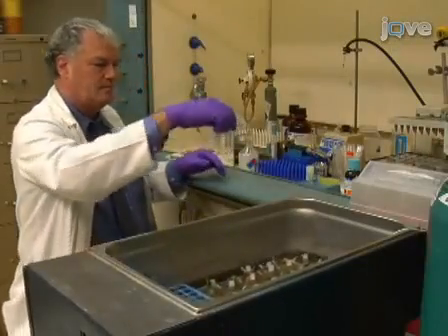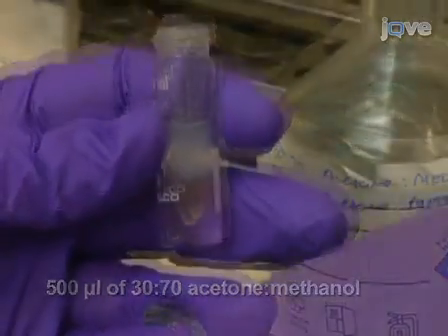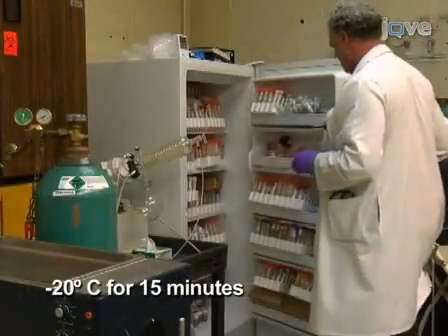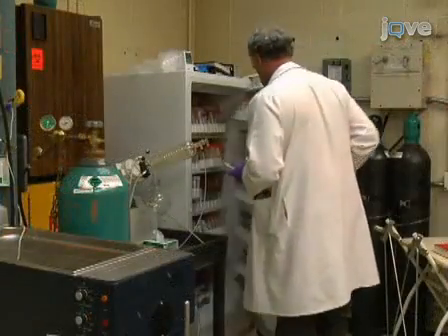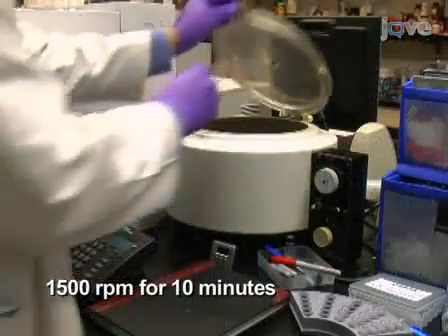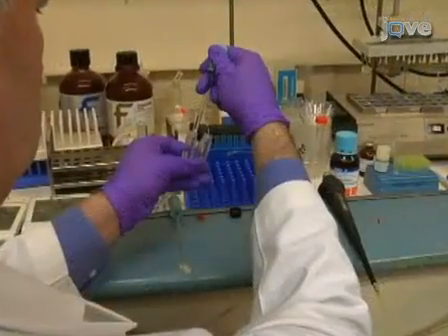Immediately following the urease treatment, add 500 microliters of a 30 to 70 acetone to methanol solution to the samples. Replace the rubber septum with a Teflon-coated septum and chill the sample at -20 degrees Celsius for 15 minutes. Remove solids by centrifugation at 1500 RPM for 10 minutes, and then decant the supernate into a clean 2.0 cc reactive vial.